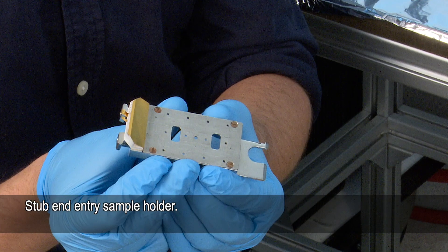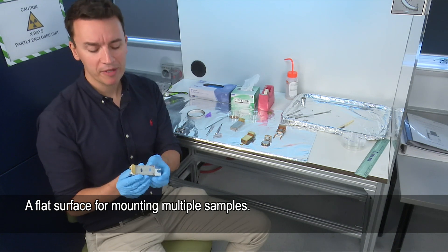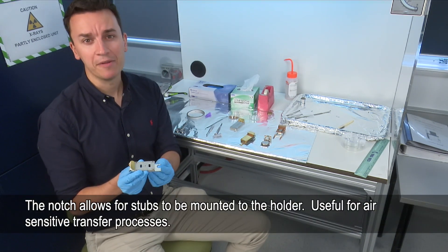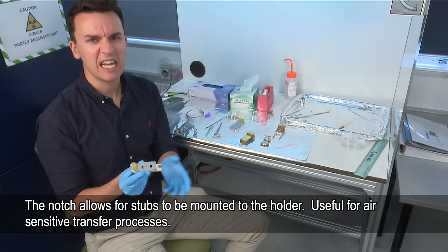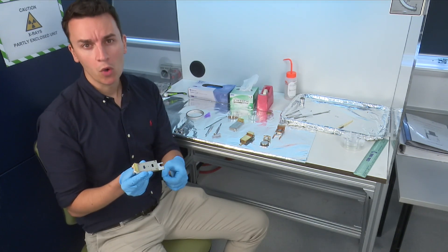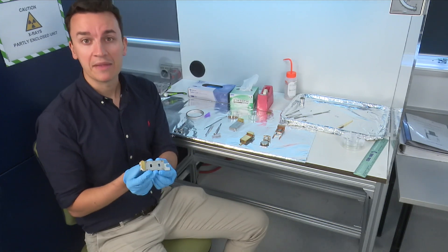The next sample holder is the stub end entry sample holder. This is very similar to the plane dual height sample holder — it has a nice flat surface, but it also has a notch on the end. With that we can add stubs, so if we're doing an air-sensitive transfer which requires the sample to be on a stub it's very helpful, or if a sample comes already on a stub we can just put it onto the end there.